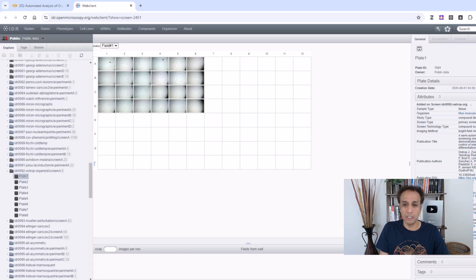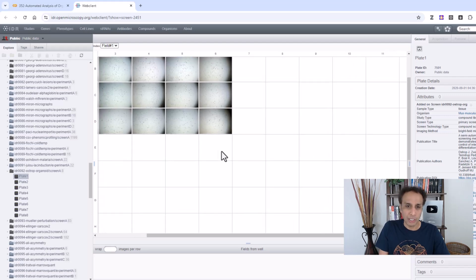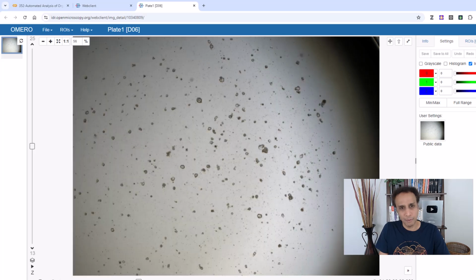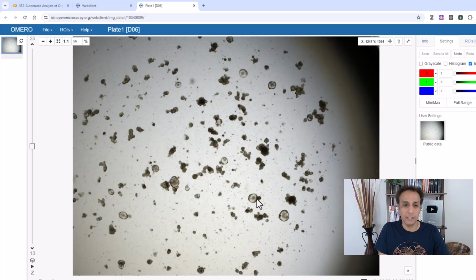Yeah. So each one, in fact, I think I can zoom in, right? I don't think I can go through each time point here. Maybe I can, I don't know. I just double clicked and it opened. Okay, so this is great. So you can see the original image, time point 1, time point 2. You see how the organoids are growing. Time point, let me click here, time point 3. And let's just directly jump to time point 5 right there. And there you go, time point 5.